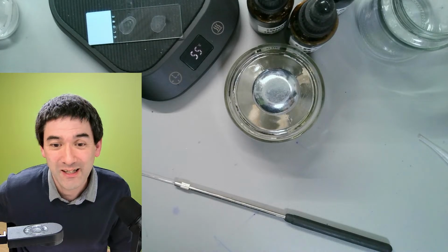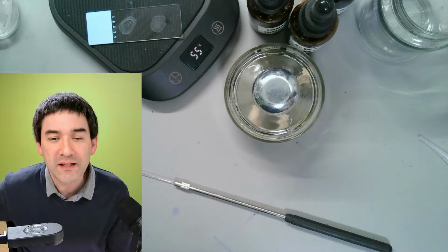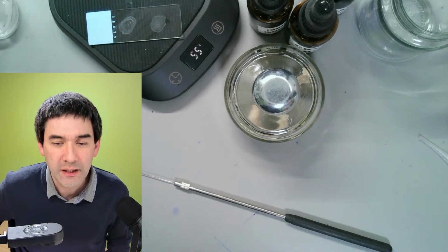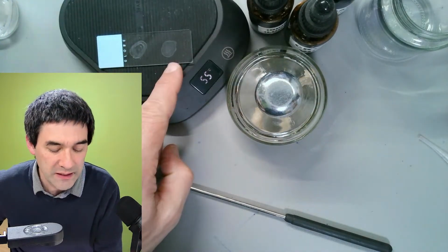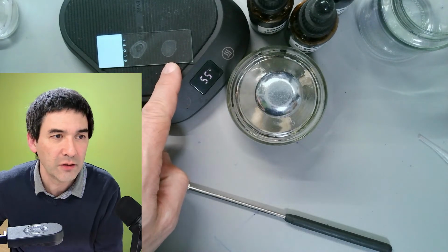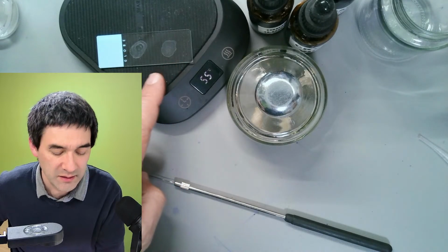Right? So interesting. We use the cover slip to spread it out. Then the heat fix. I actually don't do that. I will show you what I'm doing here. You see that this one already is dry. This one over here not yet. You can actually now see that the color has changed. It has turned white, and this is actually a nice sign that essentially the slide has dried.